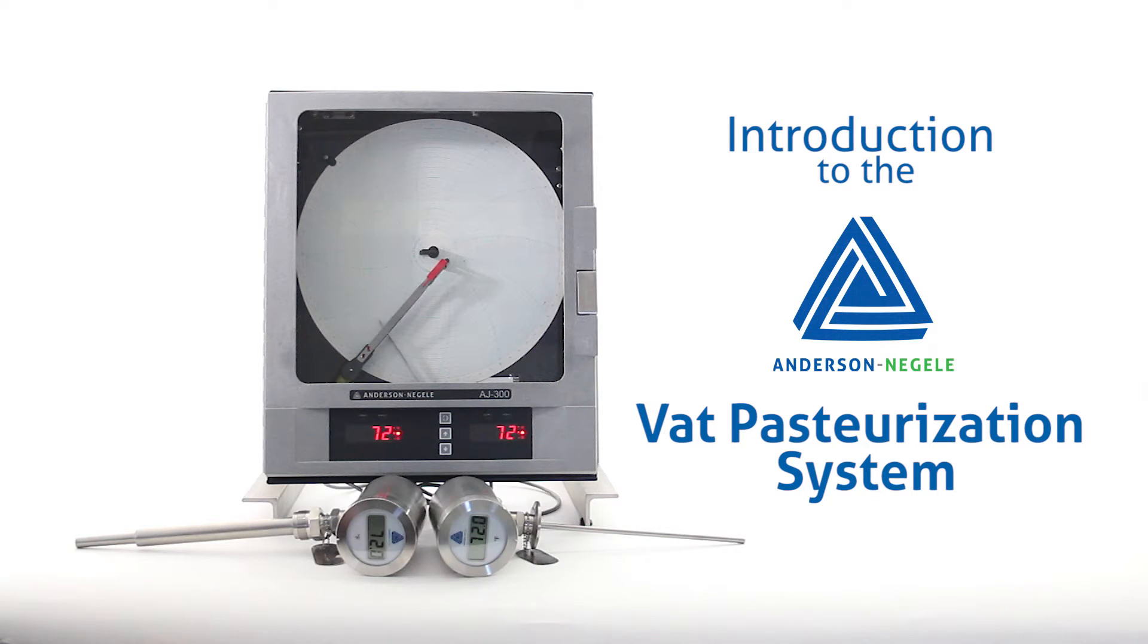This video is a general introduction to the Anderson Negola batch pasteurization system. We're going to go over the three main components of the system.